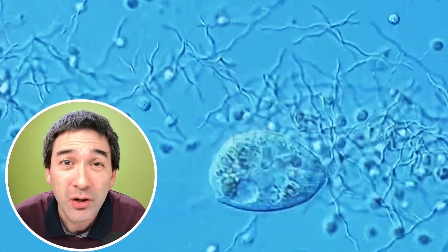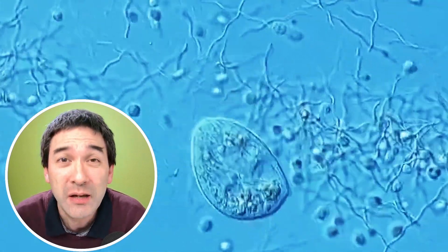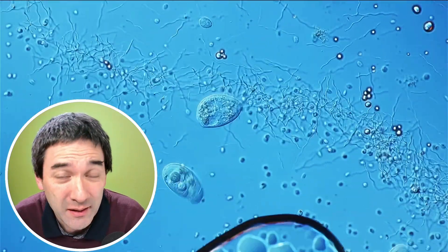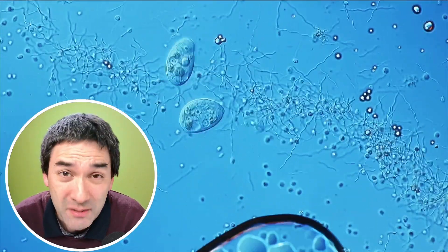Yes, these are bacteria that are found in a water sample. The density of these spirochetes is quite high. So how is this possible?